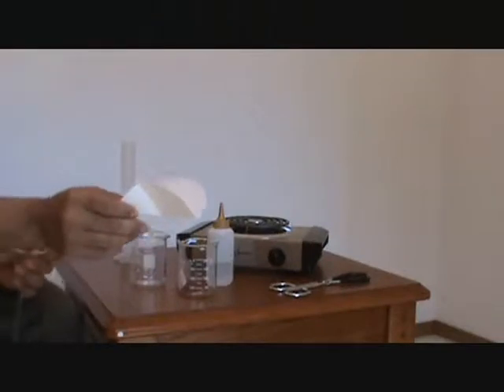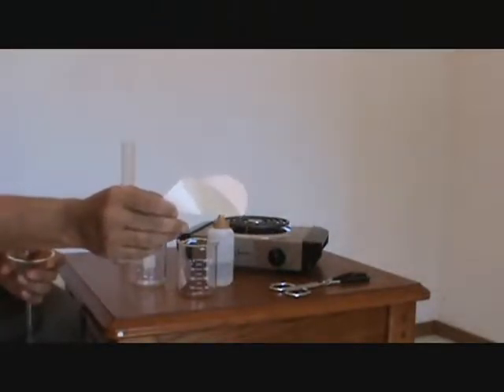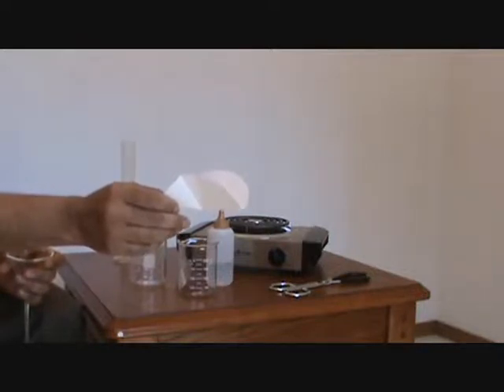The mass of this filter paper is 0.9 grams. I will now make a filtration setup.